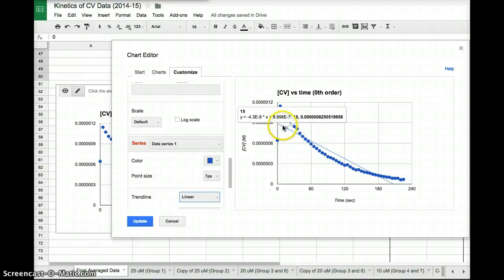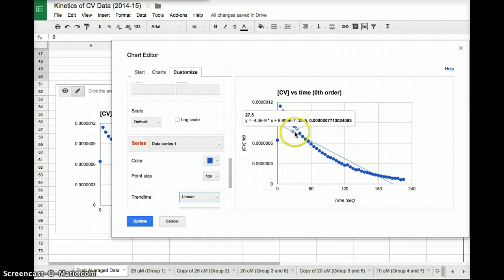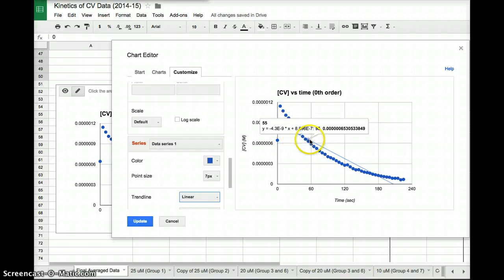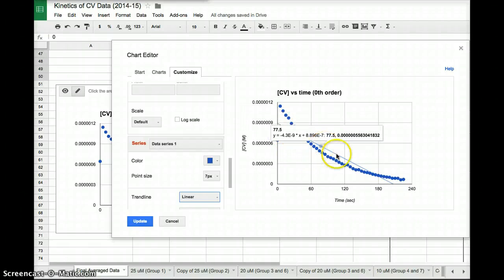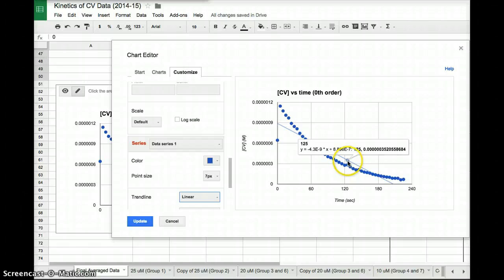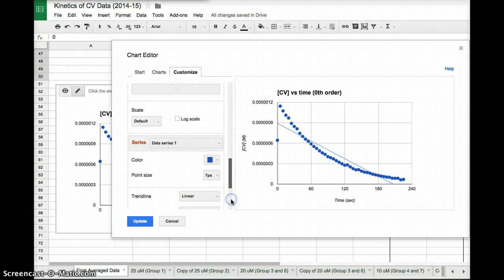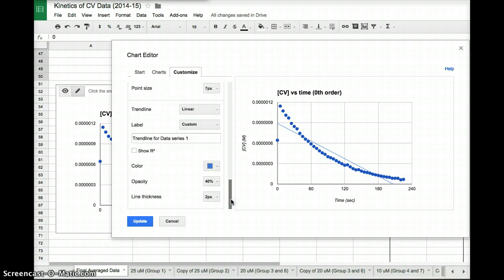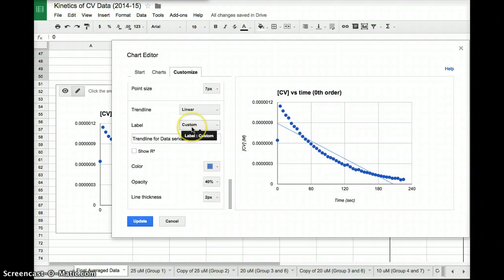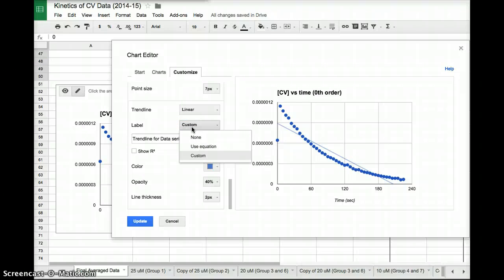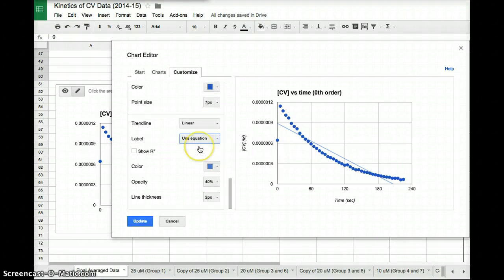And as we can see in light blue, a best fit line has been drawn for us. Okay? There's a few more cool things that you can do. For example, let's say we want the equation of that line, y equals mx plus b. If I click on label custom, use equation, I can get the equation of the line by moving my mouse over it. Okay?